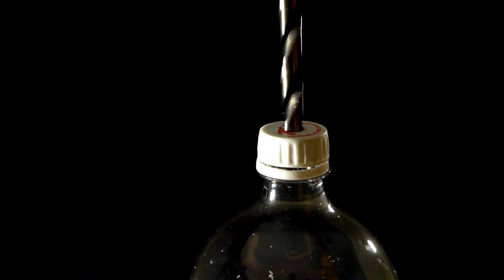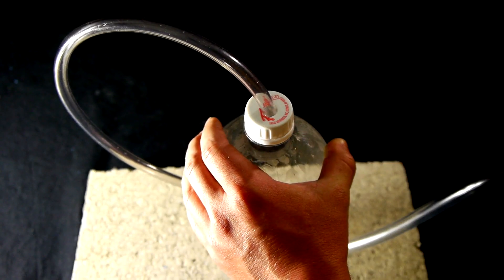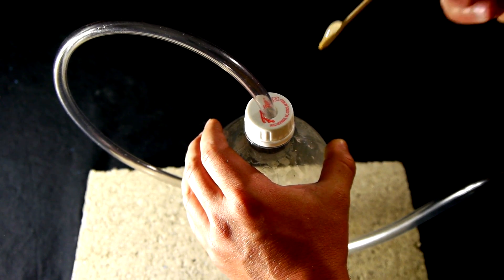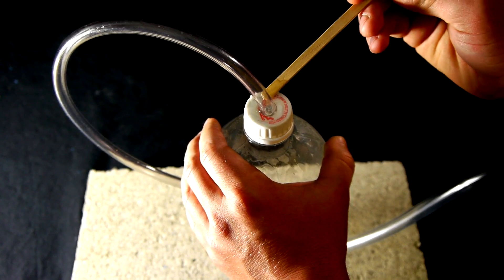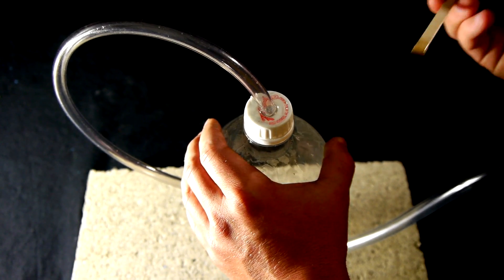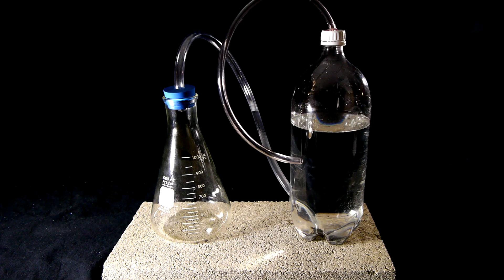A hole is now drilled through the bottle cap to fit the smaller ¼ inch tubing. The end of this tubing is then inserted and likewise epoxied into place. With these steps complete, what we now have is a setup where hydrogen gas can be produced in the flask on the left. As the gas is produced, it is directed through the 3/8 inch vinyl tubing into the bottom of the 2 liter bottle which is filled with water.